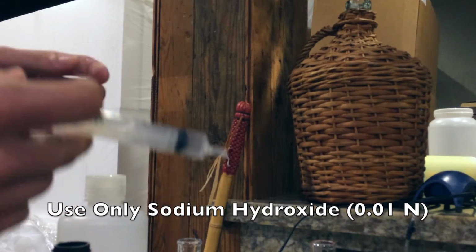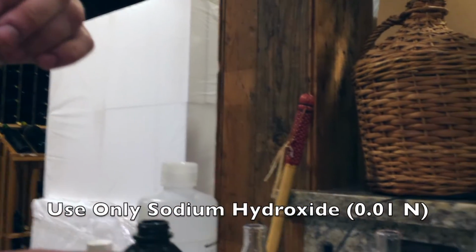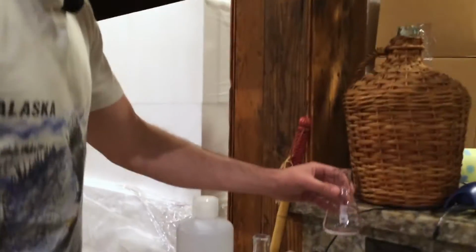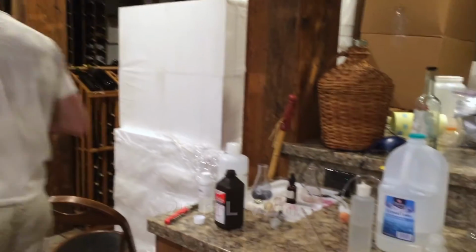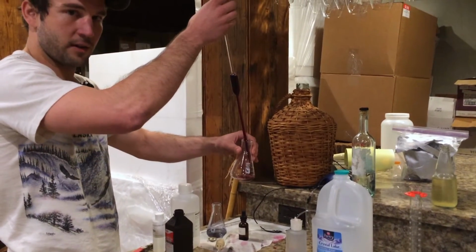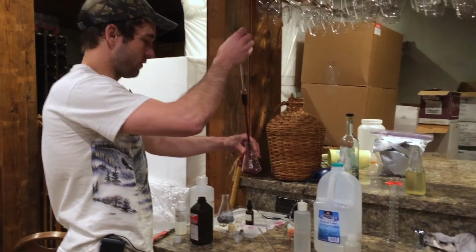And also know that this is the 0.01N sodium hydroxide, not the 0.1N that you would use for titratable acidity testing. Cool. So next we're going to grab our wine. We grab 25 milliliters of wine. In this case it's our 2014 Old Vine Carignan. Put our 25 milliliters of wine into our wine flask. I got a W on it just so that I know that this is the wine flask and not the hydrogen peroxide flask.